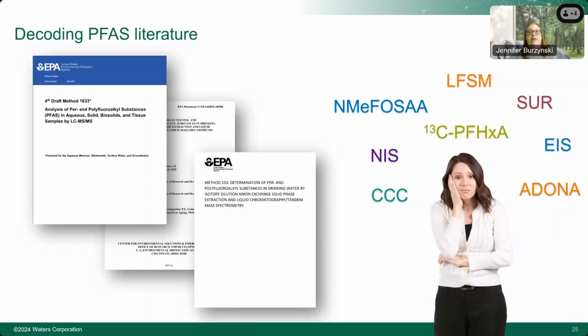So I wanted to cover today the training and support as foundations for success for water and soil analysis testing. So why would you actually need training and education? For those of you that have gone to the EPA website, you can download the literature for 1633, for 537. But for those of you that have read it, it can be very overwhelming. There's a lot of acronyms. There are quite a few pages, up to 70 pages. And there's really a lot of translation that has to happen from the end user.